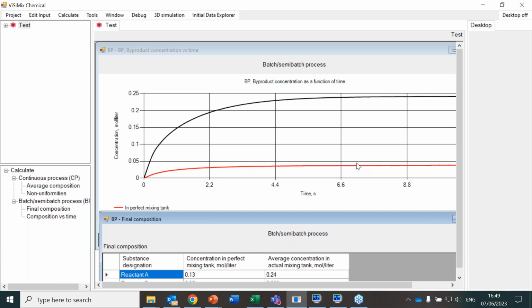We are really connecting the real environment and the main reason for the deviation when we are transferring the process from one side to the other.